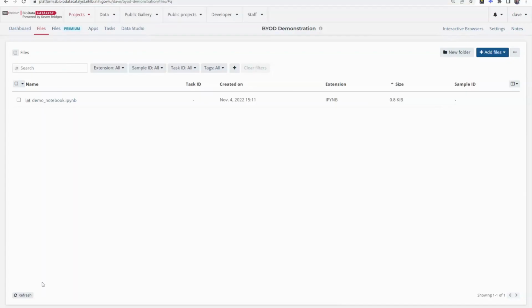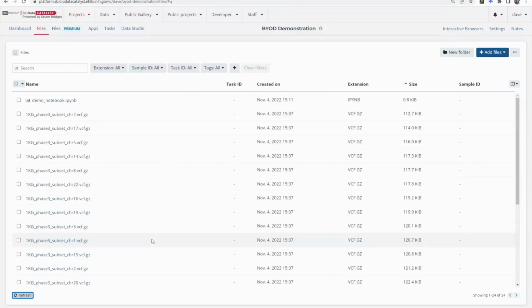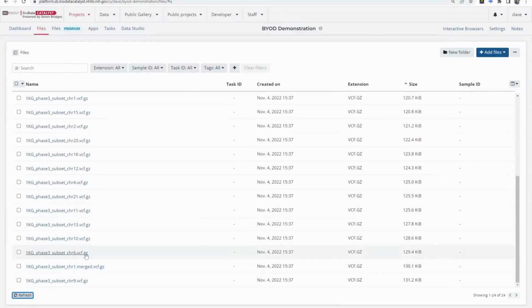So if I go here back to our project and hit refresh, you'll see all the files here. These were all very, very small, but you can also upload very large files as well.